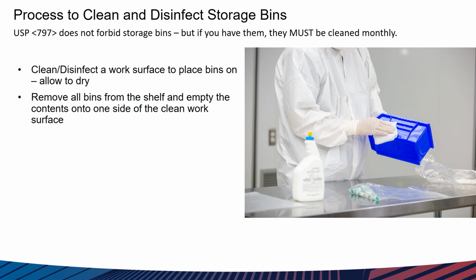Little tip here, you see in the picture, I've got the vials in a Ziploc bag versus just dumping 20 individual vials on a table. If I were to store those in a Ziploc bag, I essentially need to clean the inside and outside of that bag before placing it back in the bin.